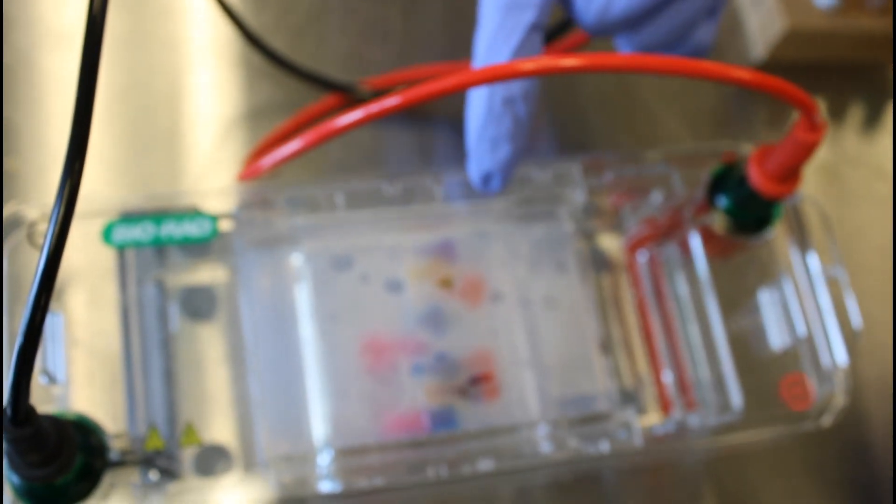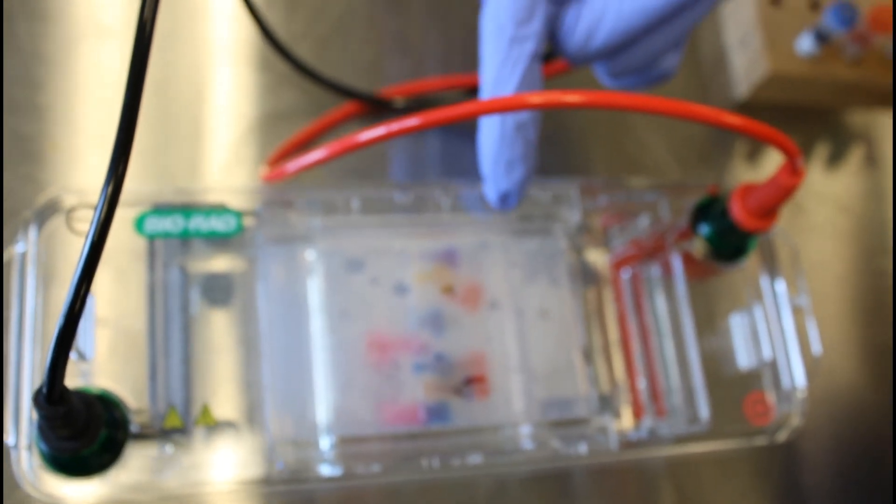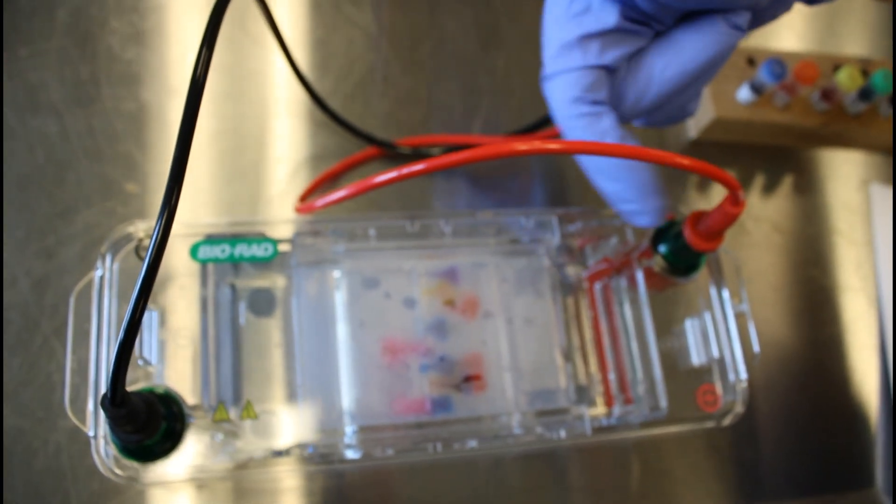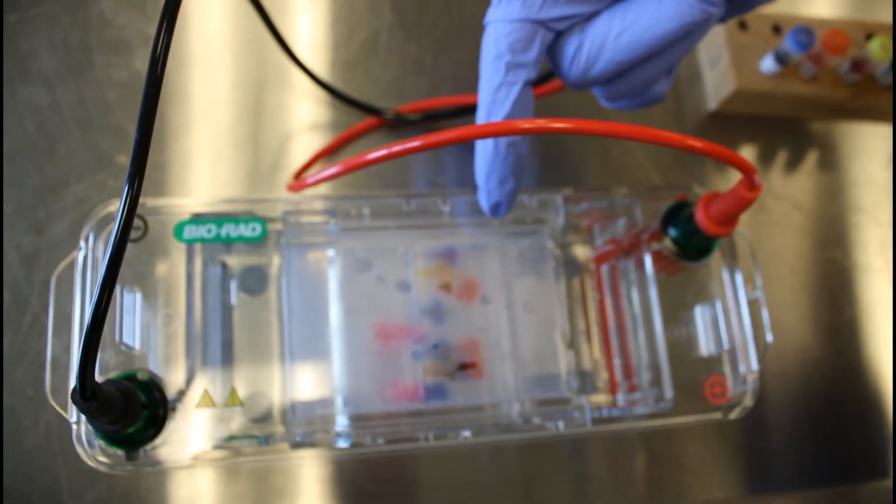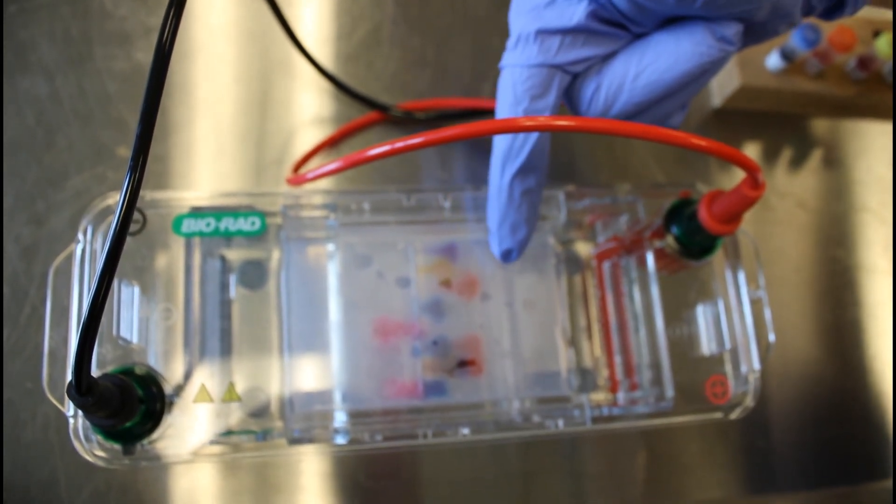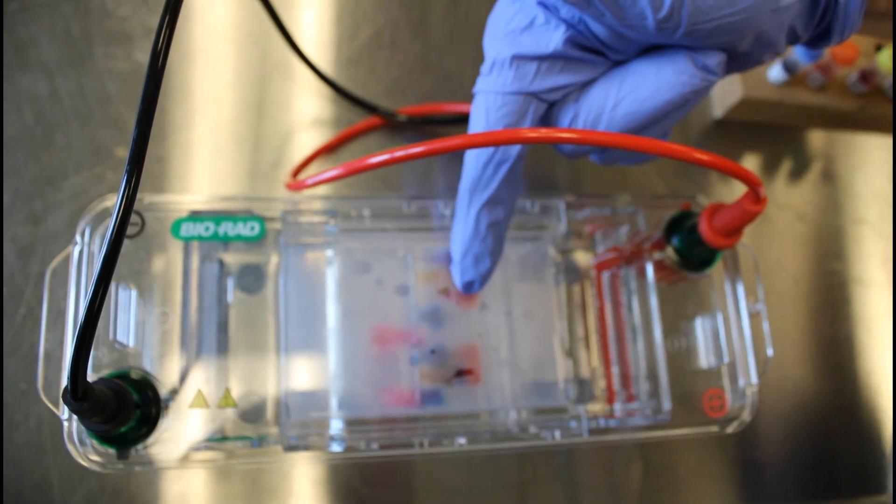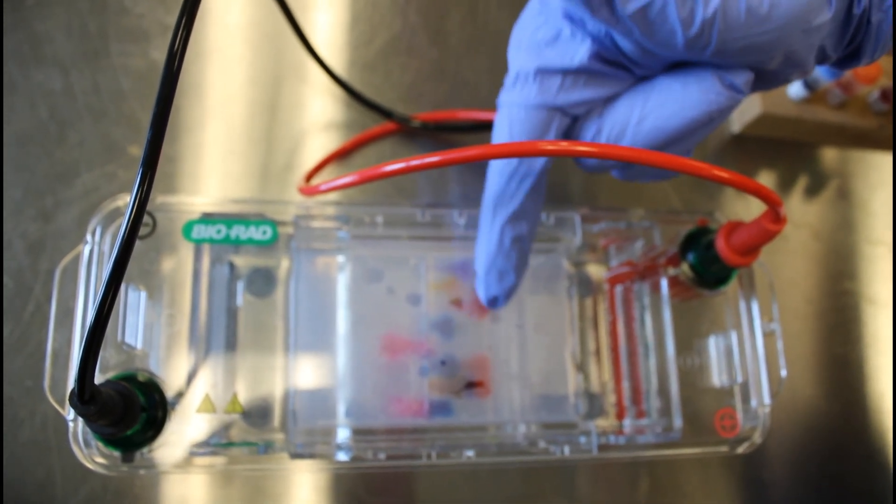Okay, so it's been about 15 minutes. We're going to let this run for 30 total, so we're about halfway through. We're still applying the 100 volts of electricity through the buffer and through the gel. And as you can see, we have some movement of the dyes. So this BB dye is getting pulled towards the positive electrode, as is the methyl orange, and the PG, and the xylene, the XC.